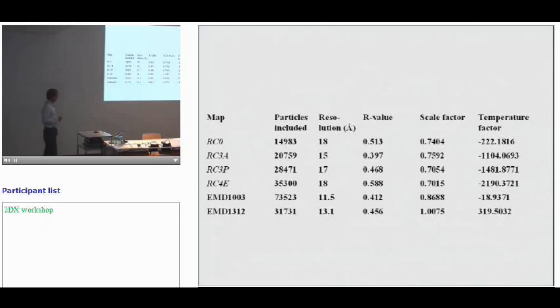But I think this could be quite useful, and one could put in any deposited map here compared to X-ray structures. I should mention also that, of course, I said I'm comparing to an existing naked ribosome structure. So these structures contain some additional densities, some factors which have been added in. So they are, of course, not identical, but with the great mass of the ribosome and these additional factors not being too large, the comparisons in this case may be relevant.